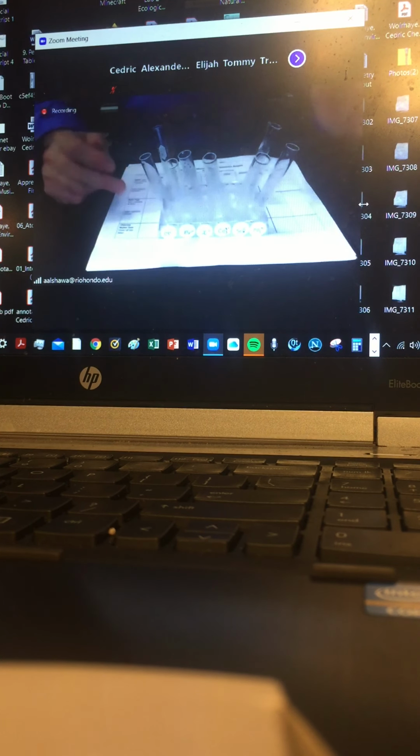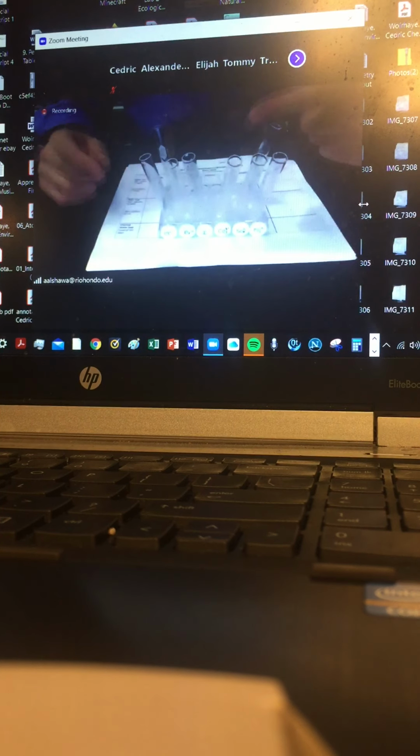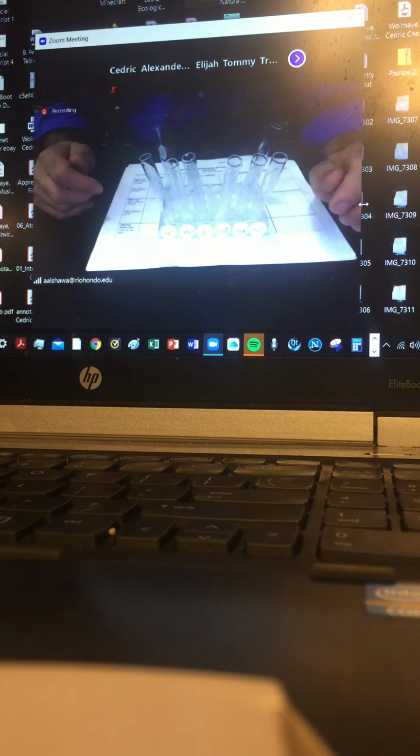The one that is specific for the sulfate. Okay, so it's not really preferential. It does not distinguish. You cannot tell whether you have carbonate or whether you have phosphate. So it is only specific for the sulfate.